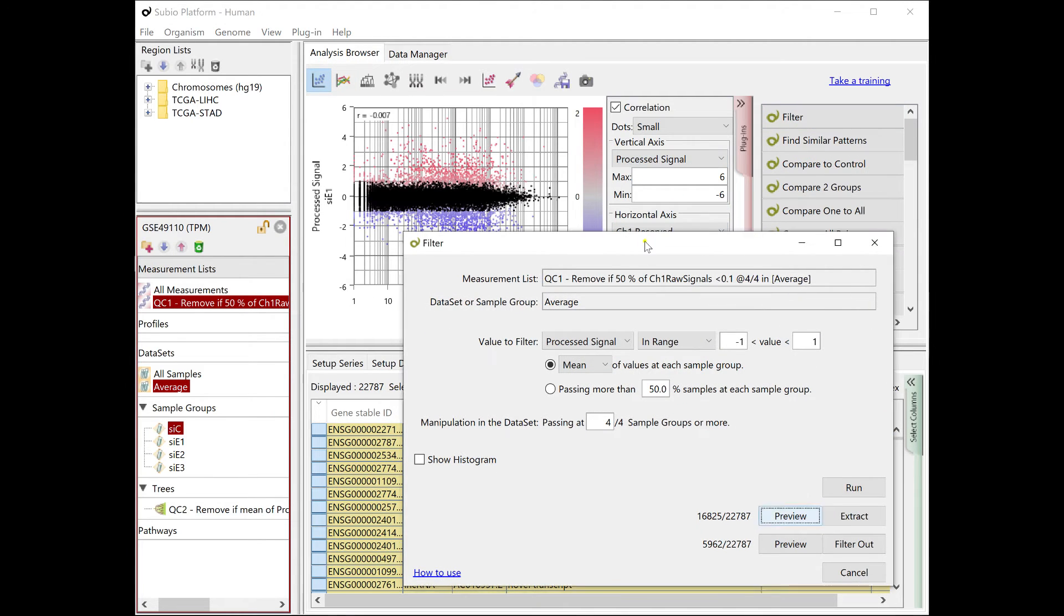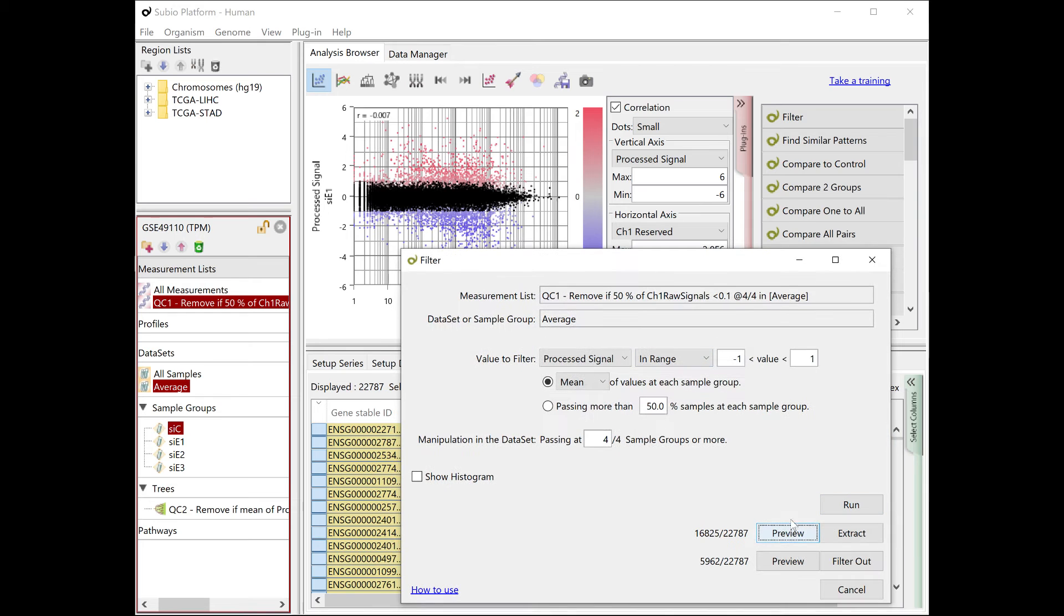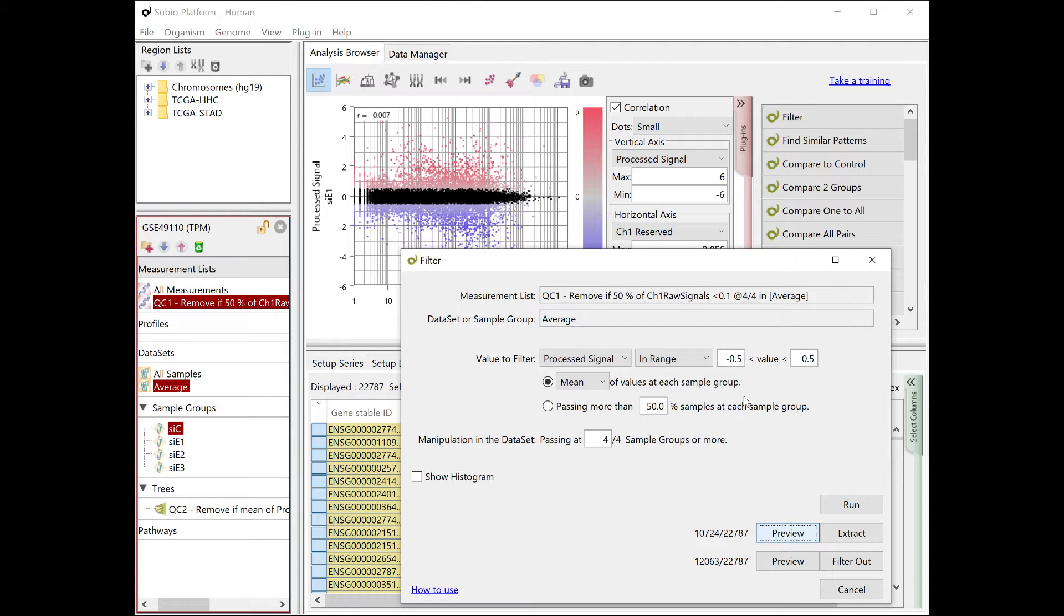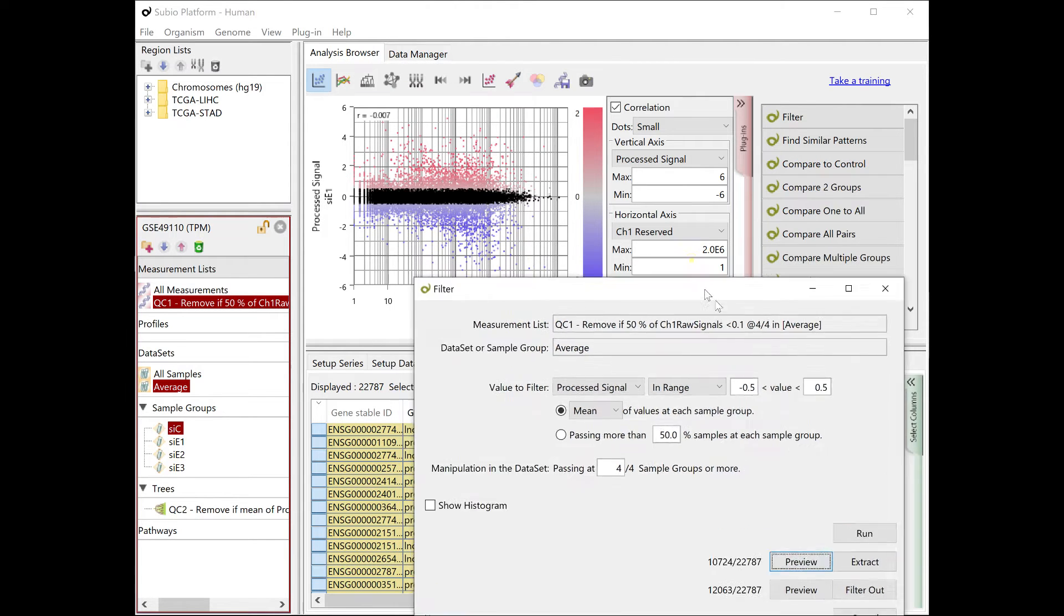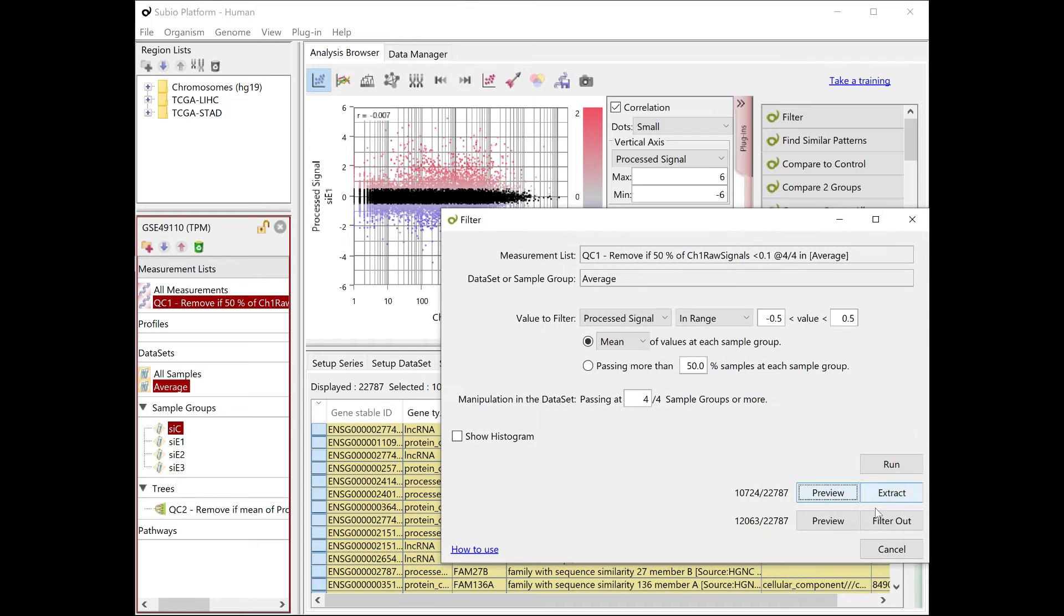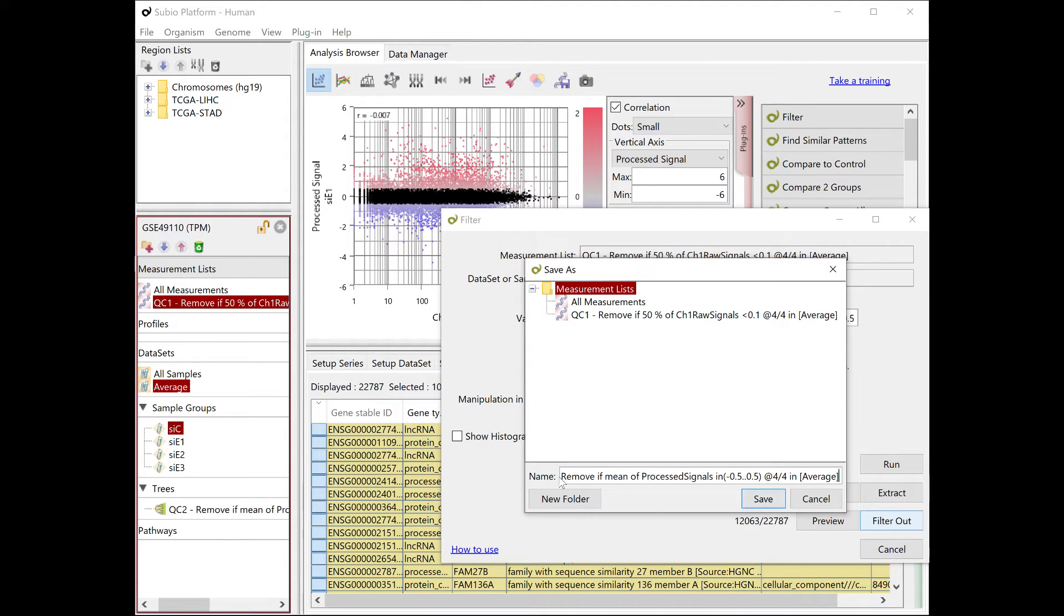The width of the thresholds seems to be too broad, so adjust them. It seems that such a threshold is appropriate to assume that the expression does not fluctuate.